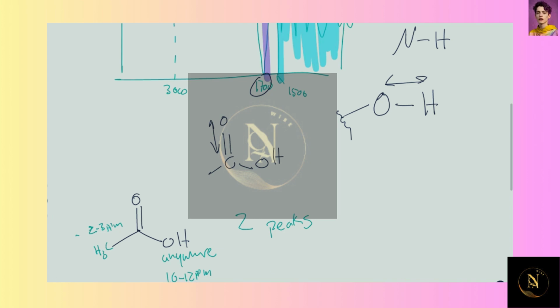The type of peaks associated, using the n+1 rule: neither of these protons have neighbors. No neighbors, meaning these are all singlets. There should be no splitting. No neighbors, no splitting. Fairly simple.